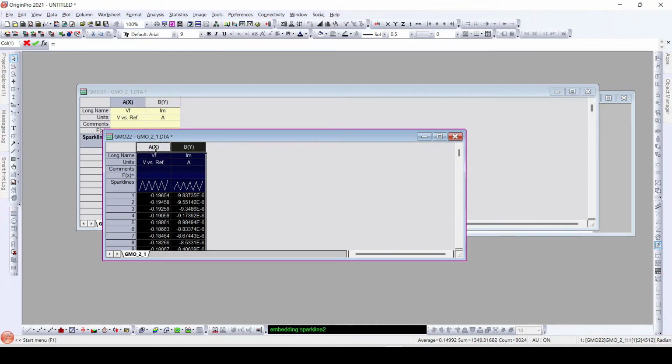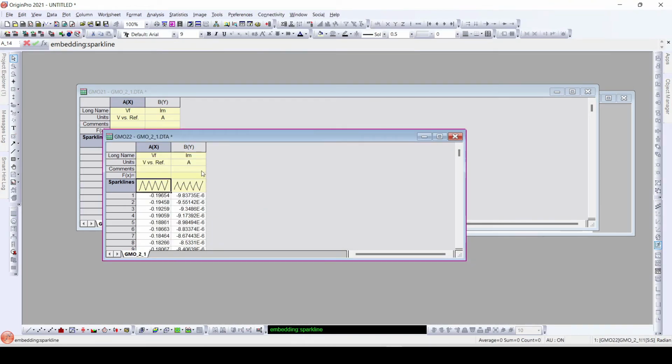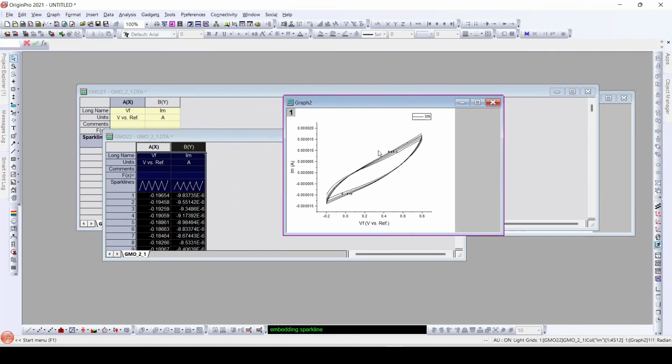which is partially imported. As we can see on these spark lines, we have dropped the data from 101 to this particular point. Also, this particular section is not required. We can even remove it using the same method, because it would be the half cycle that we can see here. Complete cycles are only 4. We can even remove this particular section of the data points by partially importing. And when I plot this, I can get directly our data.